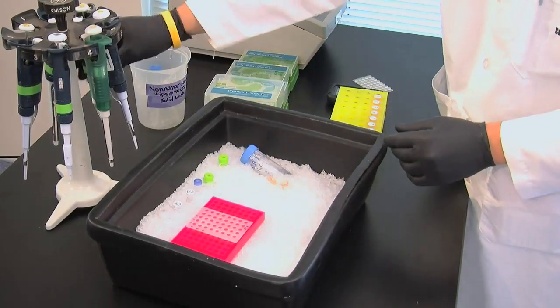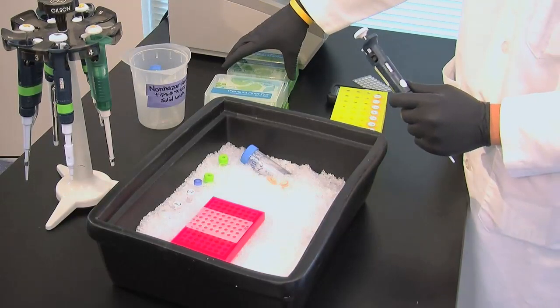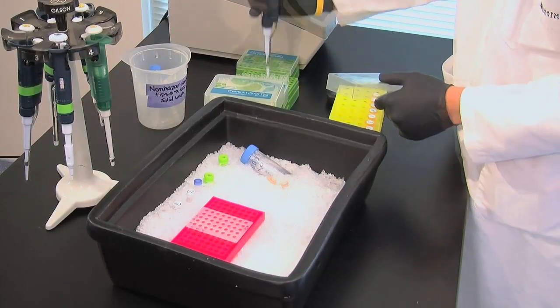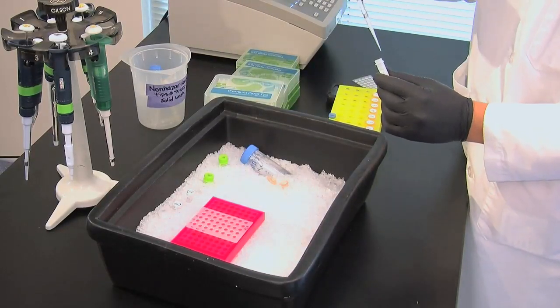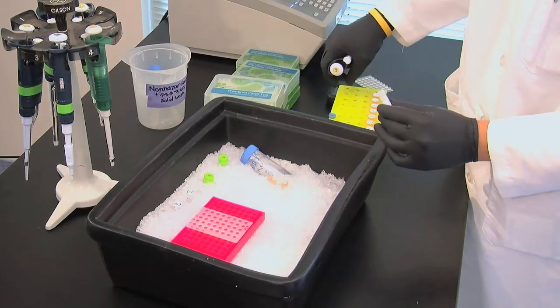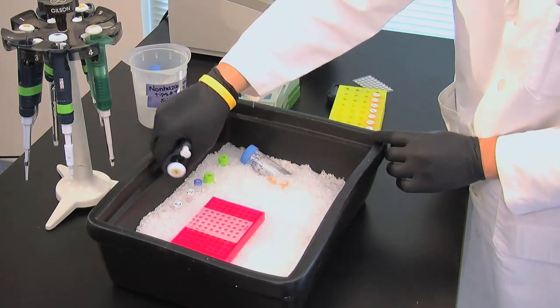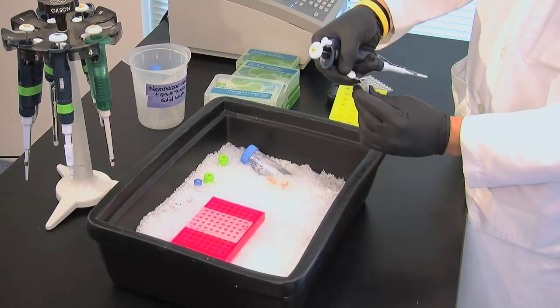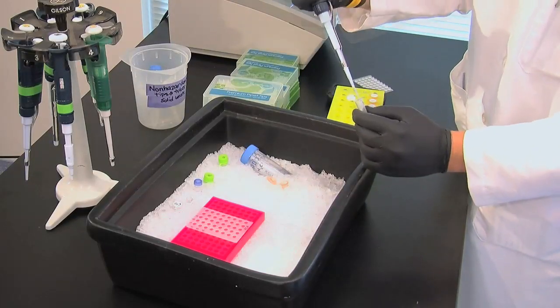Add 10 microliters of nucleotides. Add the forward primer in the same amount as the nucleotides, that is, 10 microliters.